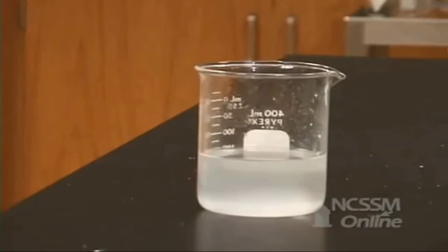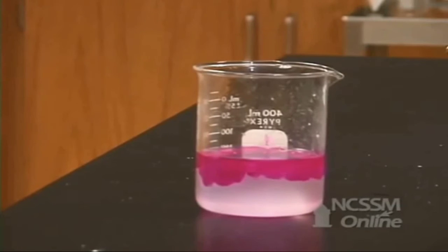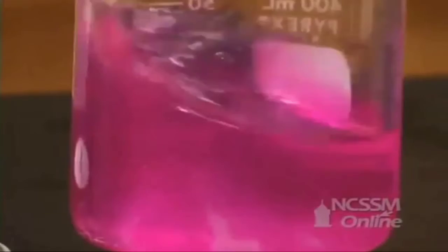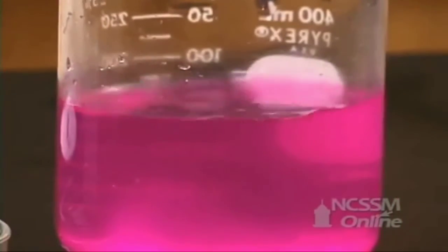We can test for the fact that we produce sodium hydroxide by adding phenolphthalein. The phenolphthalein turns a purple-red color due to the presence of the hydroxide ions, indicating the formation of the sodium hydroxide.